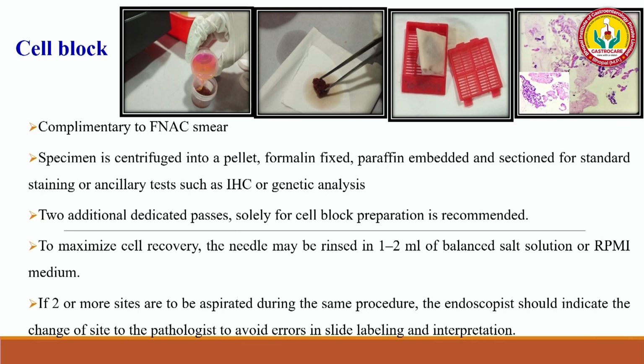So what is it that you get in your formalin container? You are going to make a cell block of it. And also, for optimally retrieving the material, rinse the needle aspirates into the formalin container, and you can process it and make the pellet, and this will act like a tissue biopsy on which you can do all your ancillary techniques. And also, when you have liquid cytology, you can use the liquid cytology containers, which will break the mucus, and so it will give you a much better background of the slides.